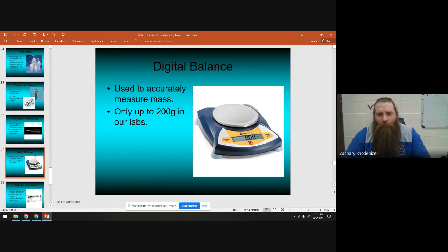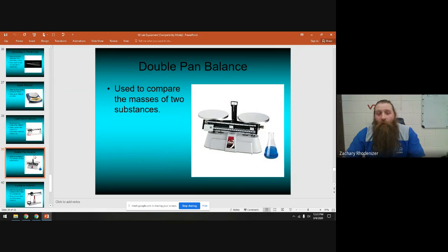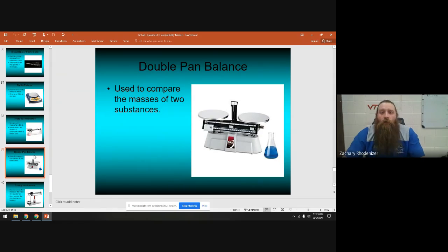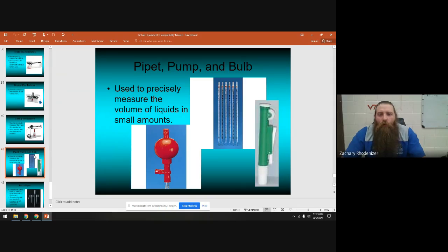The limit on our digital balances is about 200 grams. Back in the day we used triple beam balances — I don't think we even have one anymore. If you did use a triple beam balance or a double pan balance, you'd have to make sure they're correctly calibrated. The triple beam balance measures mass; the double pan balance compares masses. There's also a centigram balance for very small, precise measurements — we have a couple but rarely use them.